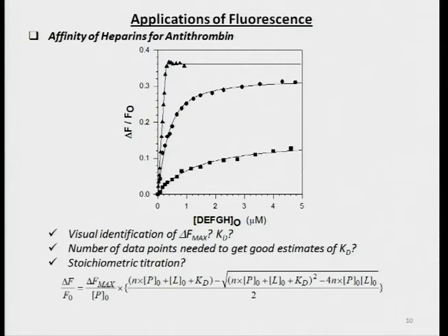Sometimes the fluorescence decreases, and if the conditions change again, you see an even lower change. The maximal change in fluorescence can be easily understood as that maximal line. It's about 36% here, about 32% here, about 15, 18% here. So that's the delta F max.